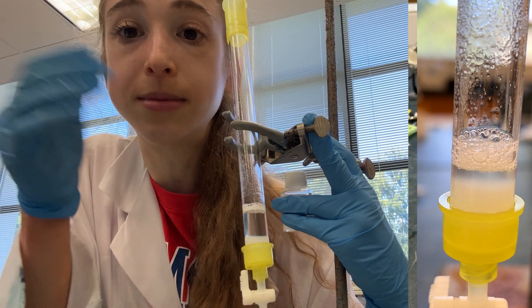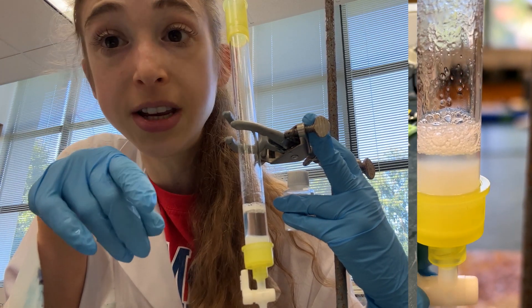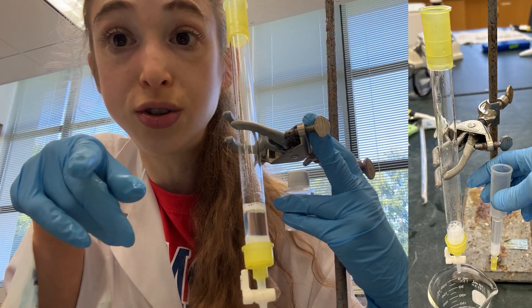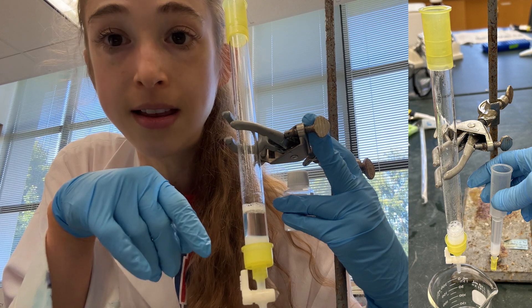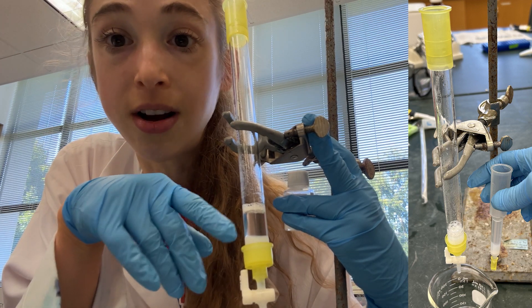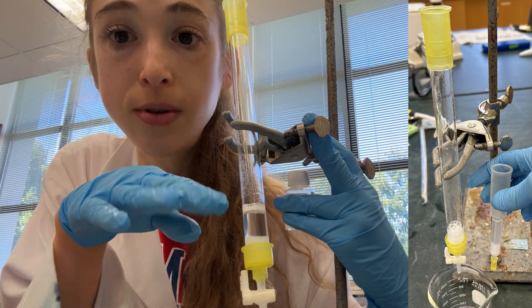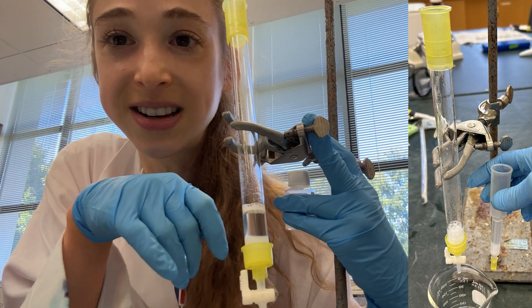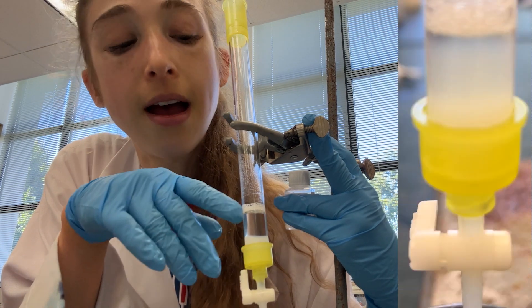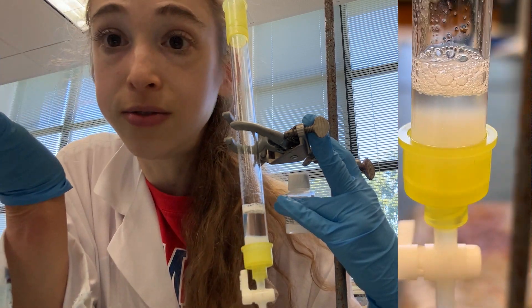So that's the basics: choose your column volume, figure out what percentage slurry you have, and divide the column volume by the percentage to get the amount you actually have to pipette in. Pipette that in, then allow it to settle down in the column — turn the stopcock and let it flow through. It'll go really fast at first, and then really slow as the column gets packed, and then the column will pack all the way down and you've got your packed column.